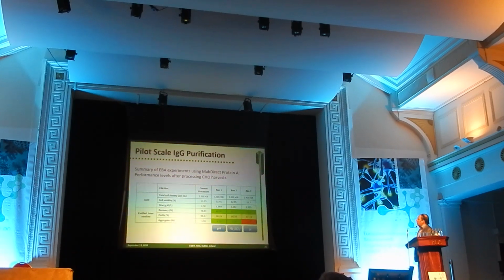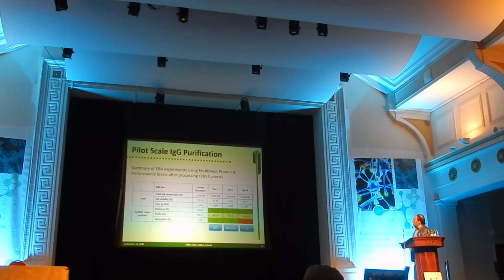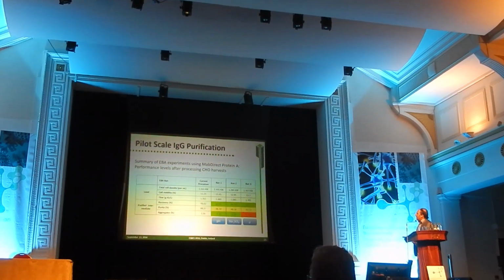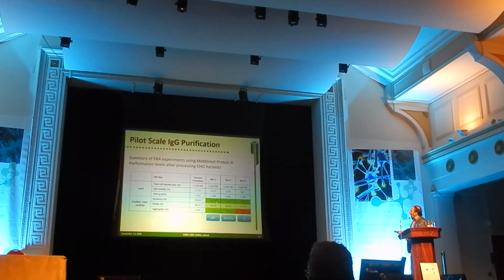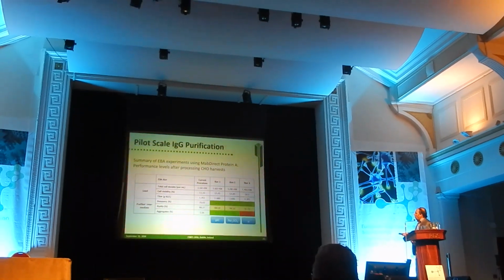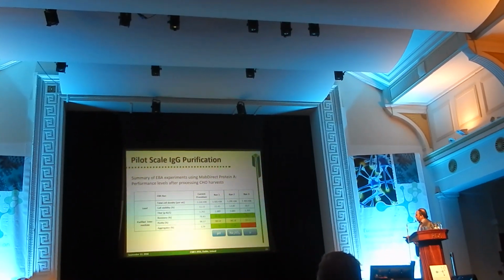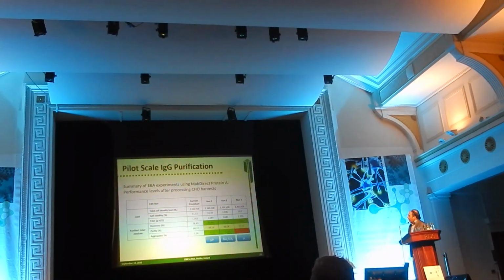And when we look into the final results, analyzing the whole purification run, you see here the current method that they had at the time, with, of course, recovery and purity and low level of aggregates, our suggestions are able to improve recovery, and they are also fulfilling very well other prerequisites like purity and aggregates. Perhaps this sole exception here, which is not critical as well, but nevertheless.